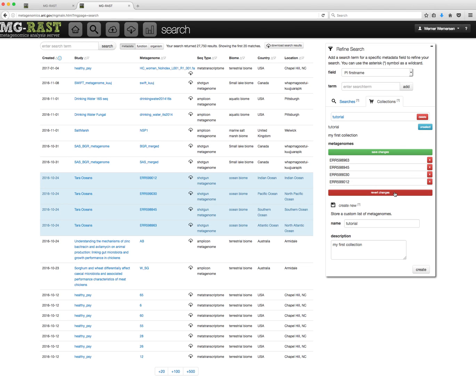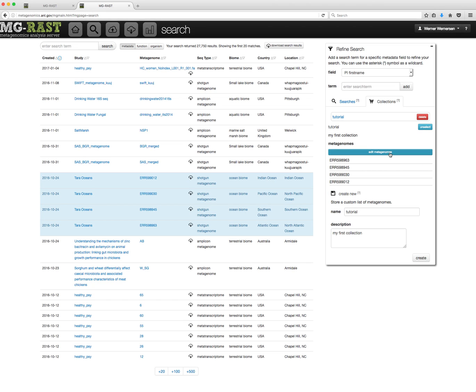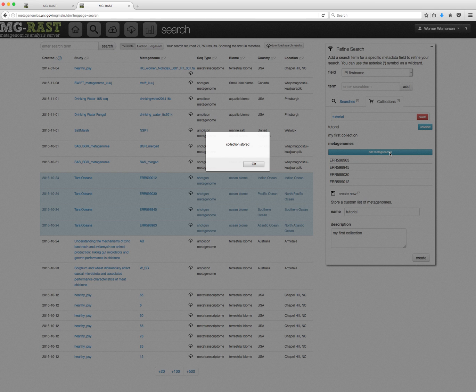If you are done with your edits, click Save Changes. Again, a pop-up will report that the collection is stored when the change is applied.